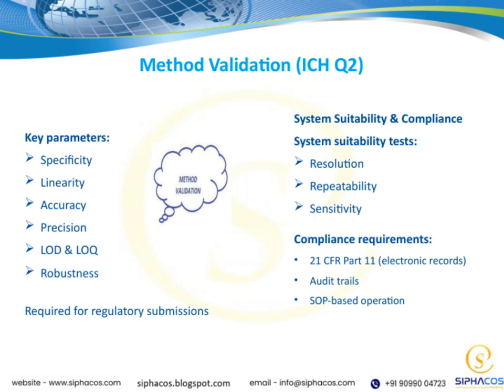All these elements, system suitability, compliance, validation parameters, are required for regulatory submissions, illustrating that our analytical approach is both scientifically sound and compliant with industry standards. This foundation supports the integrity and acceptance of our data in regulatory reviews.